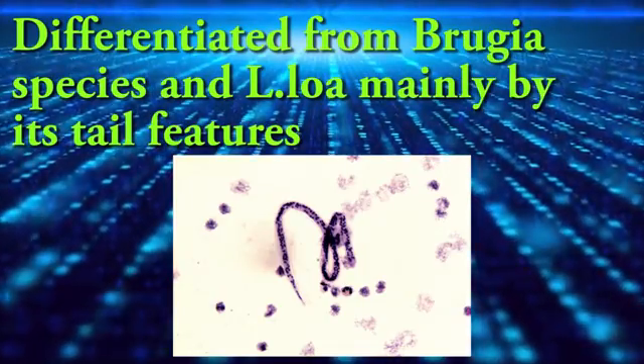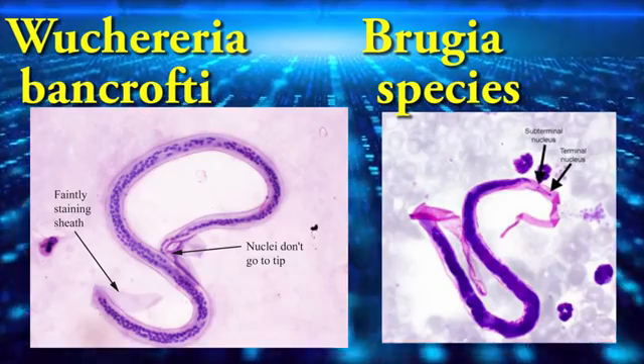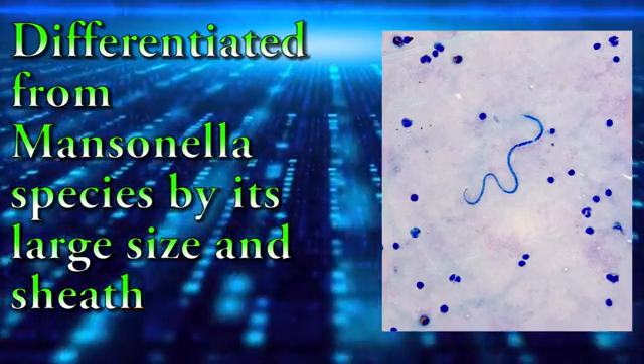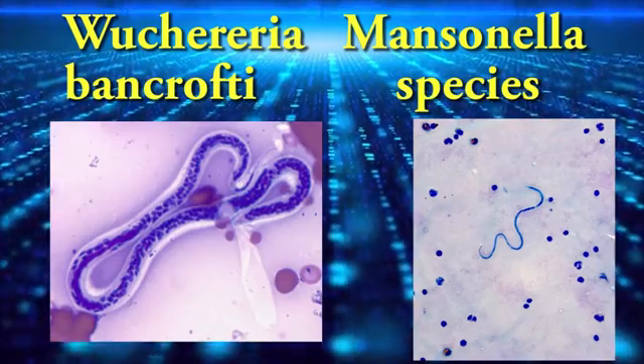It is differentiated from Brugia species and Loa loa mainly by its tail features. It is differentiated from Mansonella species by its large size and sheath.